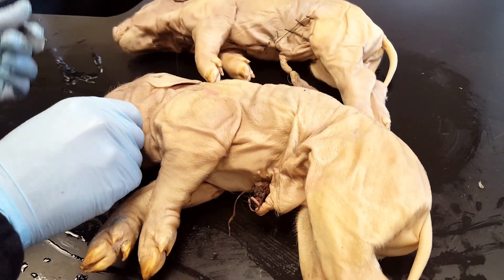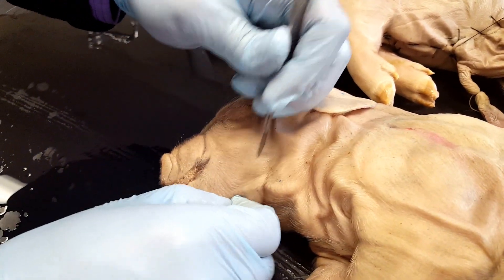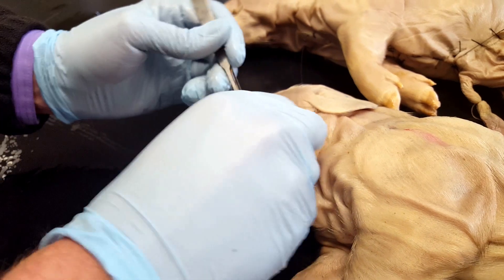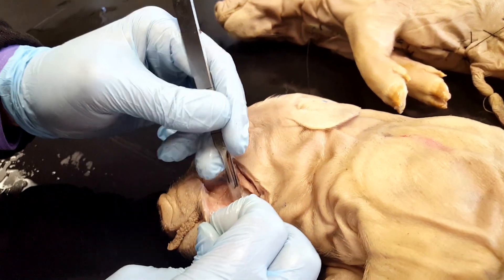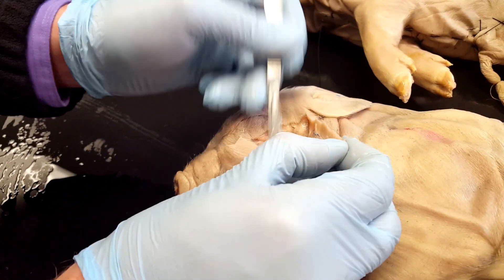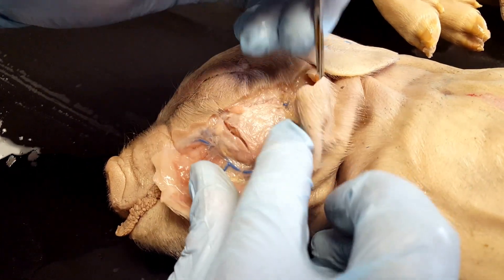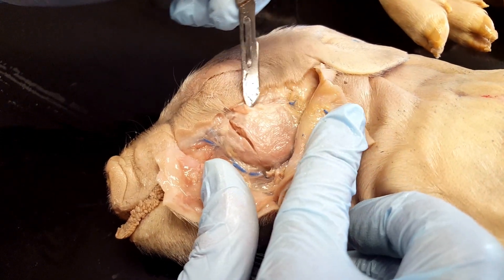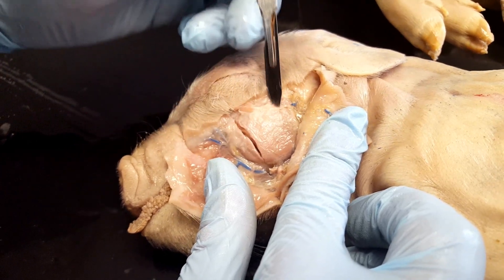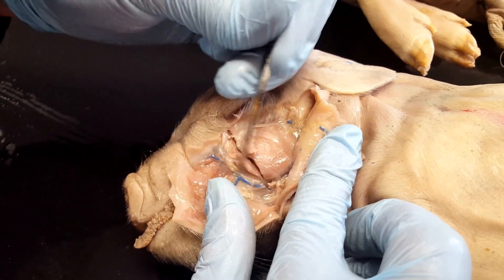The next thing you're going to do is dissect the masseter muscle. That's the one that's going to move the jaw. You're going to want to come in to the cheek, go ahead and cut in there, and cut around that connective tissue. What you'll see is that the masseter muscle forms sort of a circular shape. We could get rid of some of this connective tissue surrounding it to expose it a little more clearly.